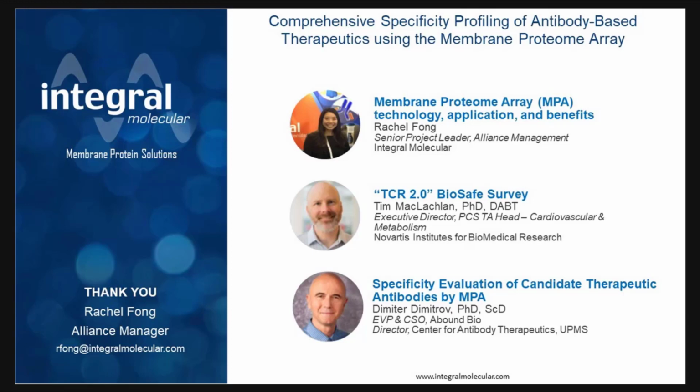Yeah, I think this is similar to a question that was asked before. We're not seeing very often that antibodies go into clinical trials and clearly have some safety event that does not appear to be at all related to pharmacology or typical antibody administration into humans. Now and again, there was actually a publication a little while back of an anti-VEGF antibody that saw that, and then went and did an array and found that it actually had an off-target that seemed to imply it was the culprit for the safety issue.